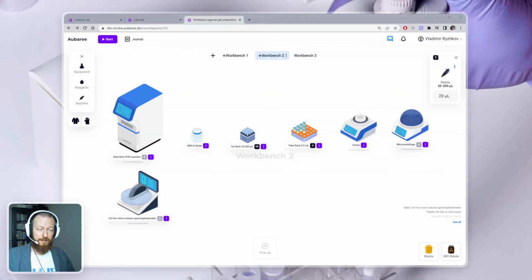And here I must stress that our product is not this particular set of instruments and processes and learning materials. We've basically established a framework to simulate any equipment, including yours. So you can transfer your protocols and learn them here.